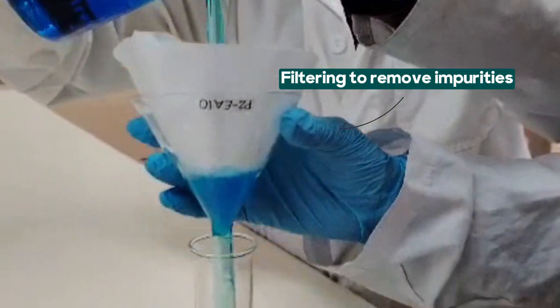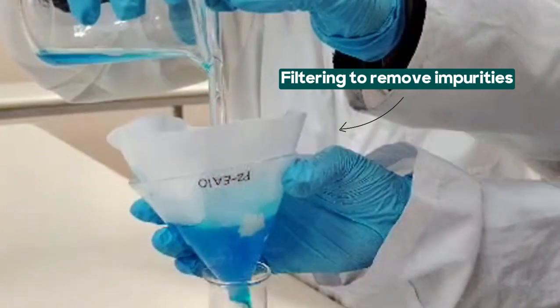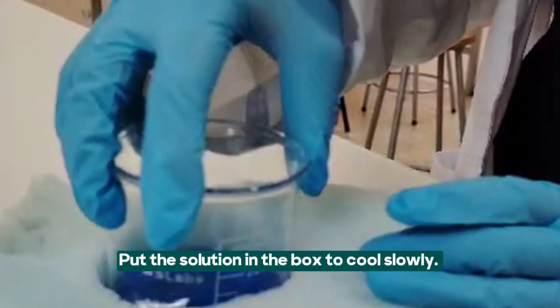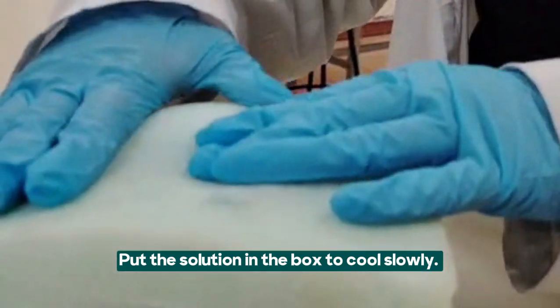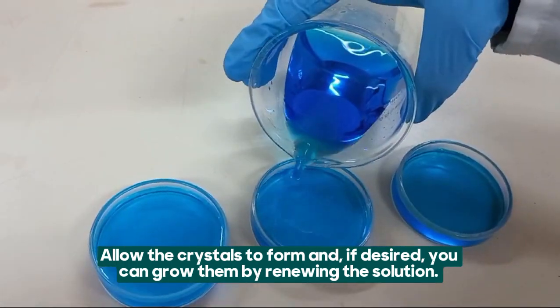Filter to remove impurities. Put the solution into the box to cool slowly. Allow the crystals to form and, if desired, you can grow them by renewing the solution.